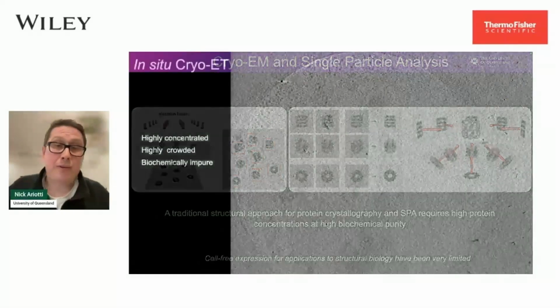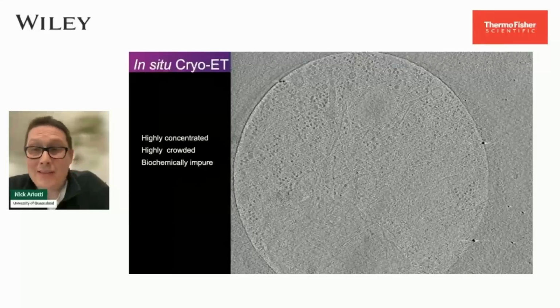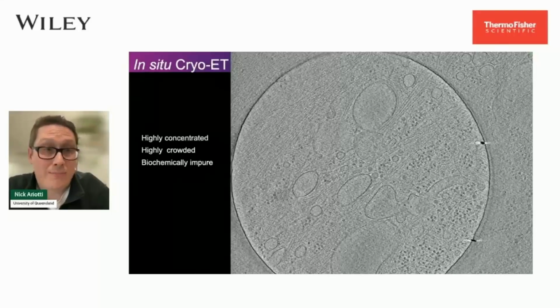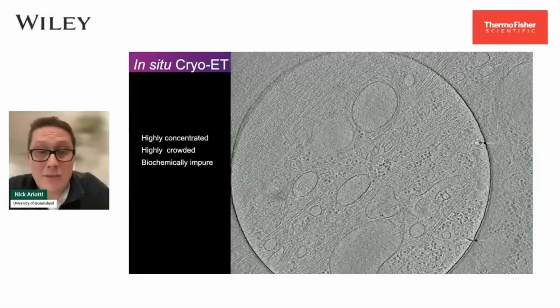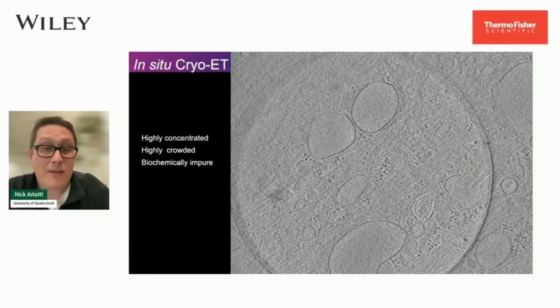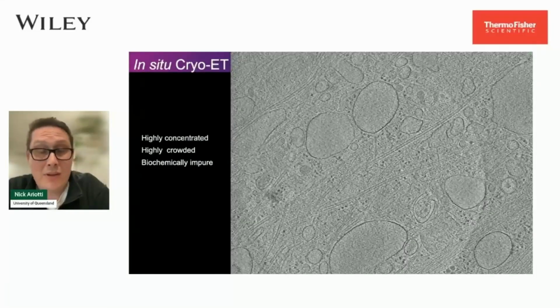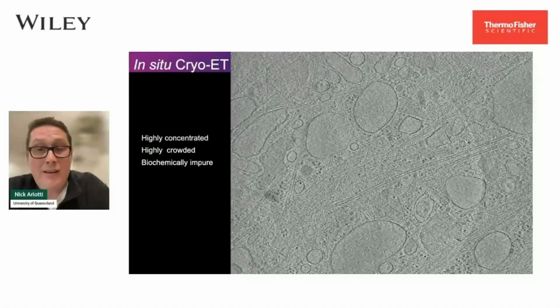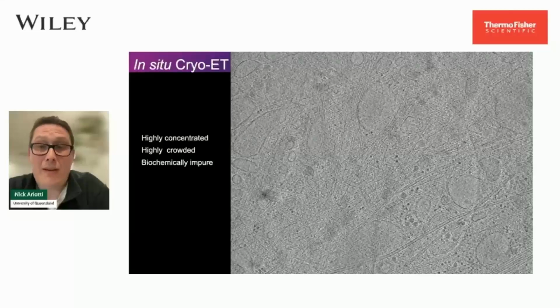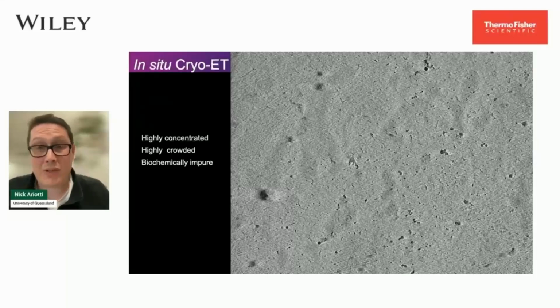It's important to note, however, that alongside the developments in single particle methods in cryo-EM, in the last 10 years, there has been the advent and application of the entire field of in situ structural biology. And the tomogram that you're looking at is the first ever in situ tomogram that I acquired, and I think it nicely highlights the difficulty of working with these kinds of samples. There is just so much information, there is so much crowding of the structures, it's really highly concentrated, and it's really hard to discern the individual events within the volume that are your structures of interest. Identifying your structures of interest is incredibly challenging.